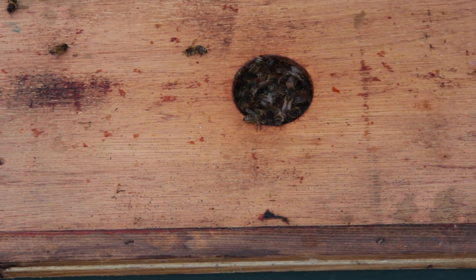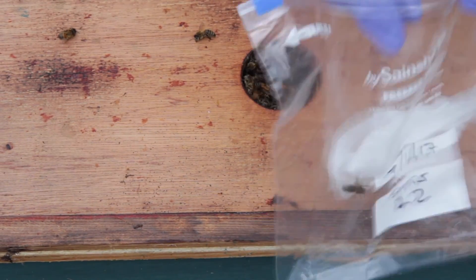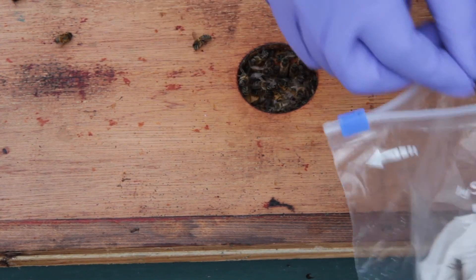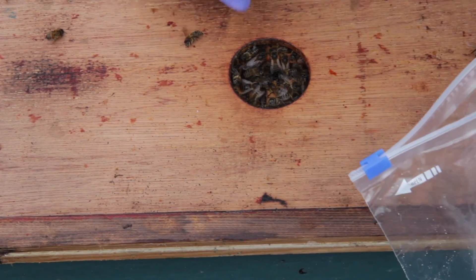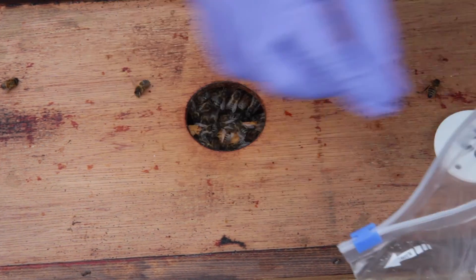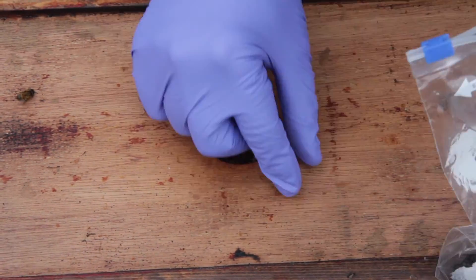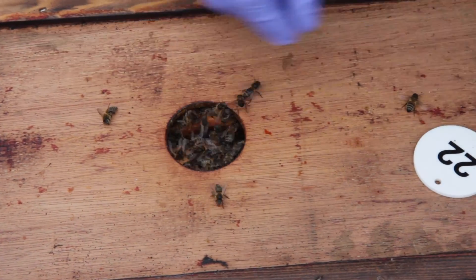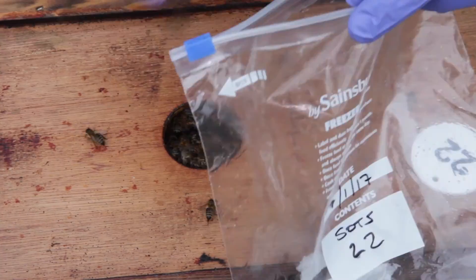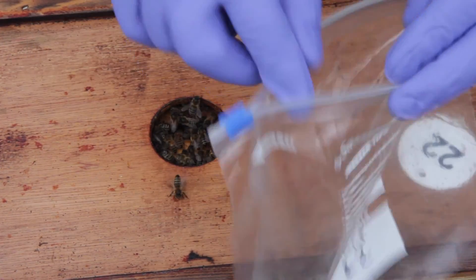You literally just pick up the bees one at a time and throw them into the bag — counting them out one by one until you reach 30.